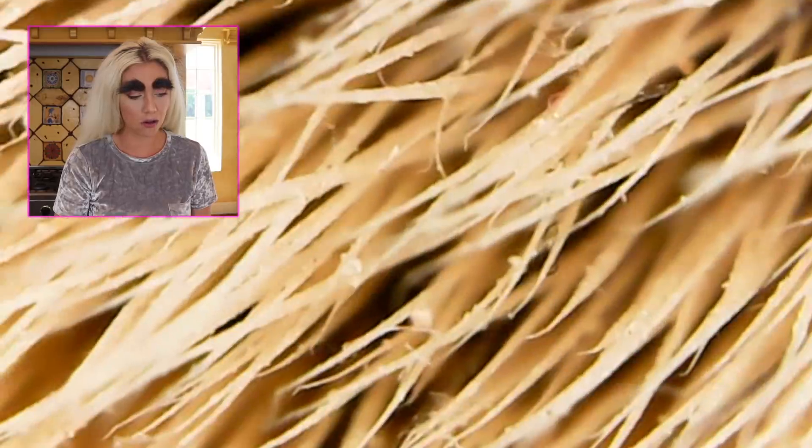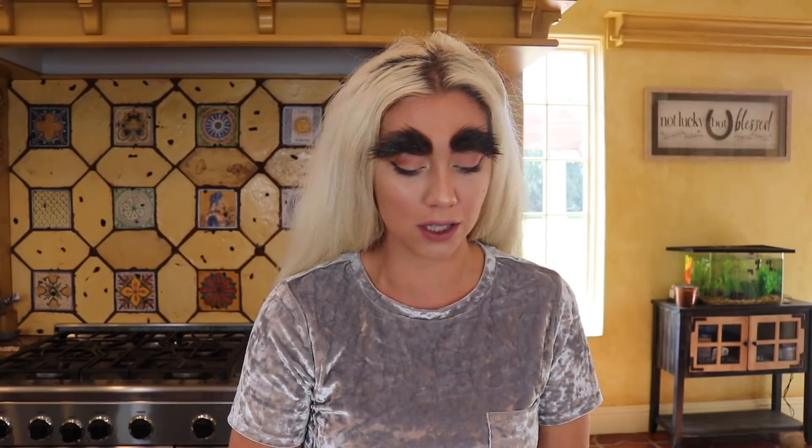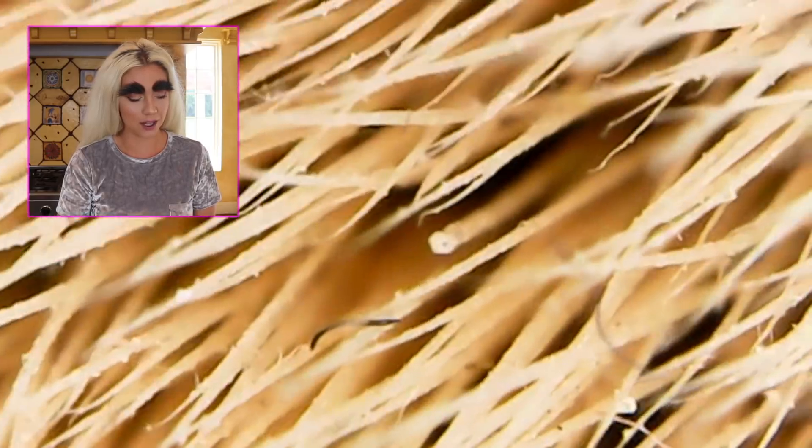I don't even think I opened this one yet. I also have an As Seen on TV brush — let's look at that first. Oh my god, that is ew. I literally used this brush one time. Watch how many beauty gurus come out with this video now — they're going to be looking at makeup under a microscope. Look at that, that is nasty y'all.